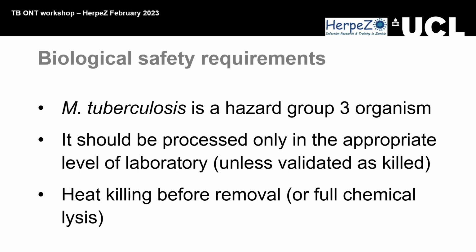That's your own, obviously, validation and your own protocols and SOPs. But we would recommend to keep your DNA as intact as possible without disrupting it. 80 degrees is definitely better, but just consider where you're going to continue to do the rest of your CTAB method. As I say, I think a lot of you are already doing CTAB, so it's up to you how you do it, but it has to be validated.